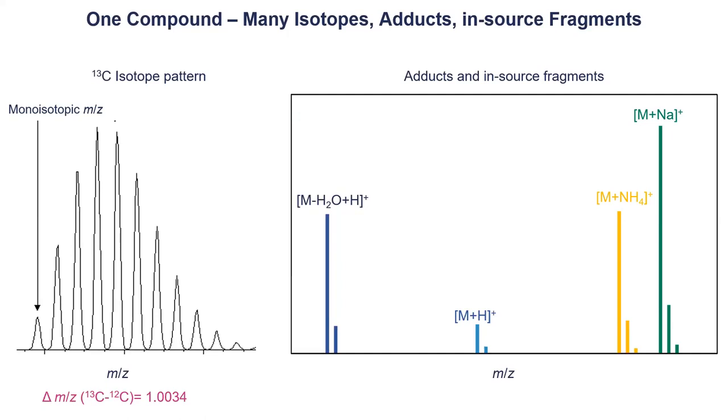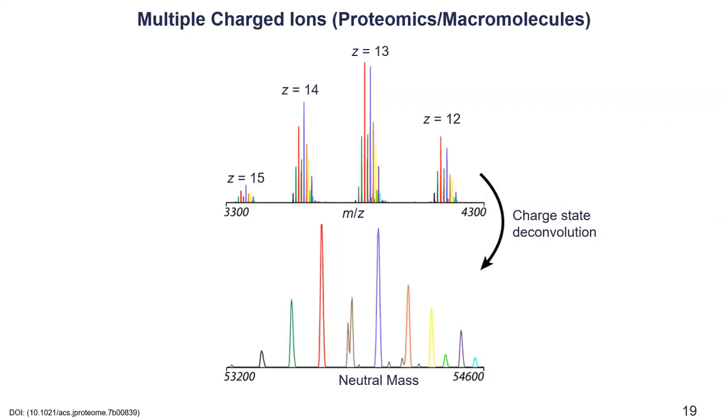But just something I want to highlight here is that you always get redundant information about one compound. So it's not that you get one signal and then it's good, but you get multiple adducts, in-source fragments, and also the isotope pattern, which is also nice because it confirms a bit of your structure in the end, right? Because you get an idea, you see it's the [M+H], but not the [M+Na], because you also see a signal at this mass change.